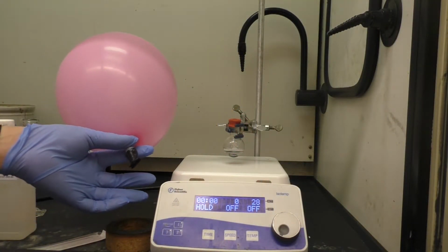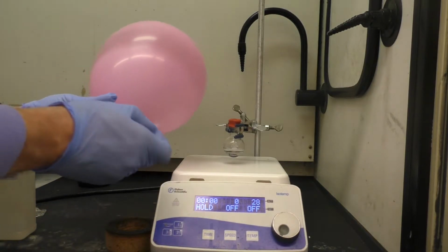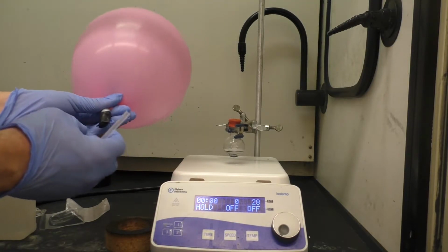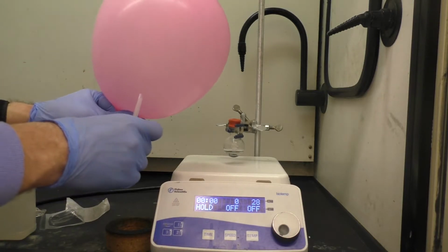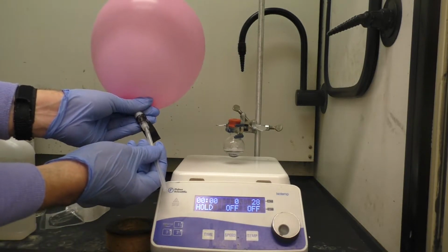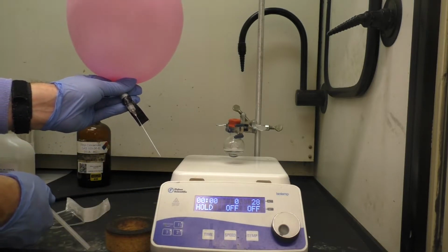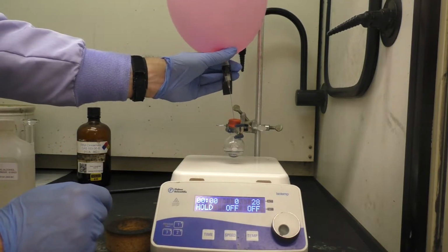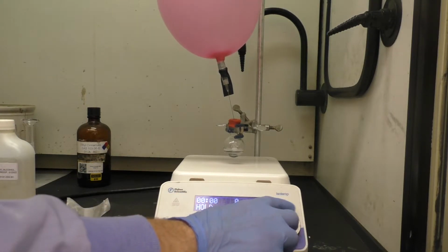So now that we have our balloon of hydrogen, we simply need to add it into our headspace here. So we've got a small gauge needle here. We'll open that up, pull this out. We can then clamp off our hydrogen balloon here so it doesn't leak while we open it up. Ooh, got a little bit of leakage. It's all right. Take the needle, screw it onto the luer lock there, and then carefully remove the sheathing. You can now simply place this down through the septum into the headspace. And then our system should have access to the hydrogen now. We can turn our stirring on.